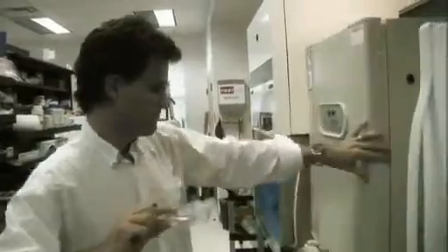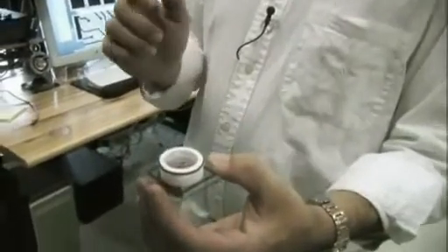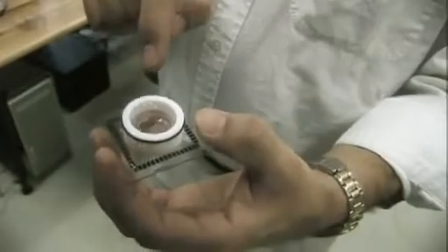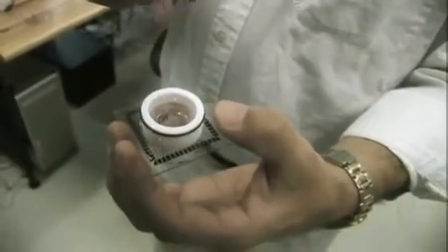Each of these dishes contains about 20,000 or so neurons which are firing away as we speak. Each one's an individual network and they'll fire spontaneously. We take living rat neurons and they will rapidly form a neural network. We have this grid of electrodes underneath the surface of these living neurons, and we can listen to the conversation among the neurons.